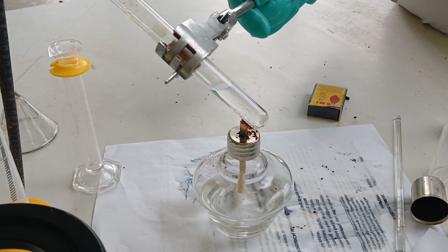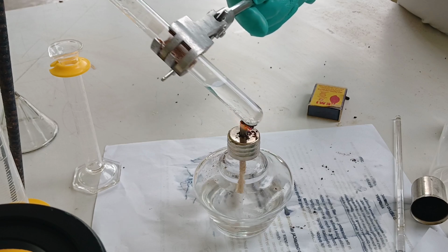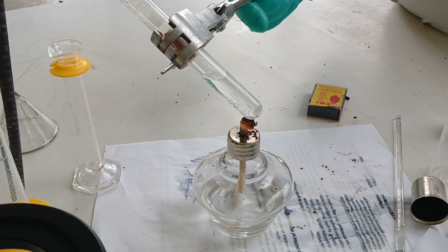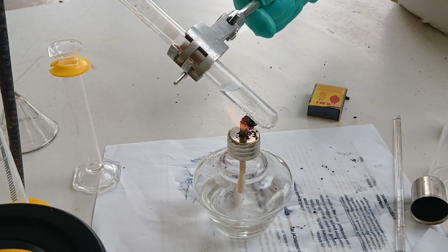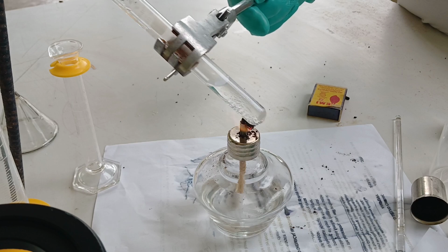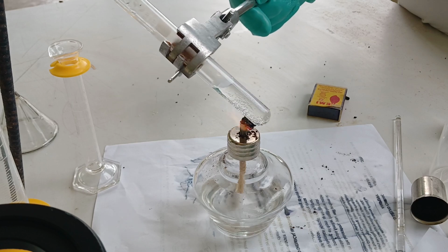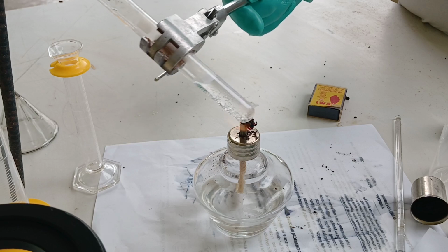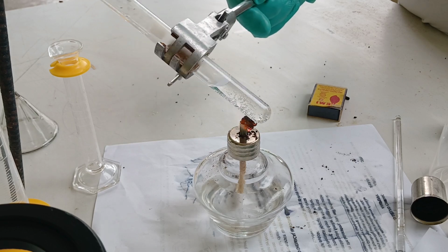If somebody is there, then let them know. Oh, excuse me, I'm heating this test tube, could you please excuse? Just like that, approach that person, or automatically remind them to keep a distance. Yes, that's the best way to heat liquid in a test tube.